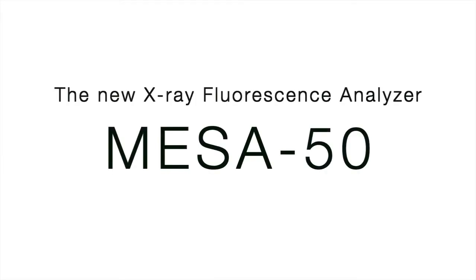The new x-ray fluorescence analyzer Mesa 50 from Horiba.